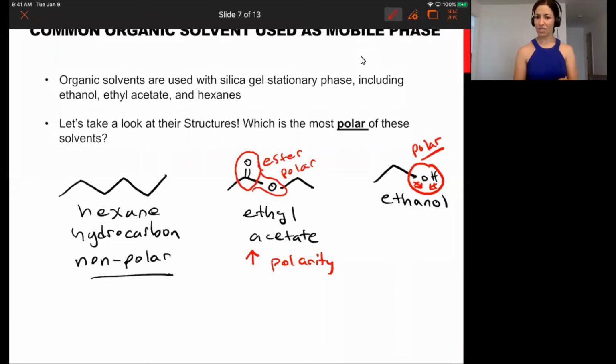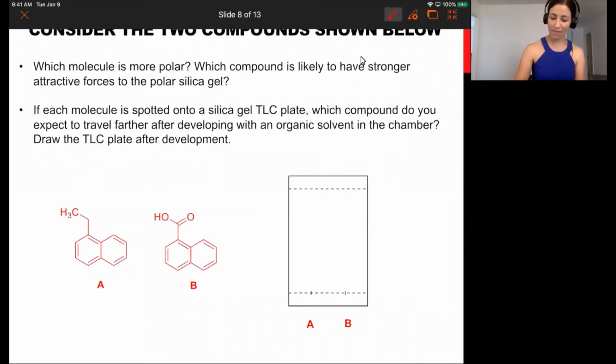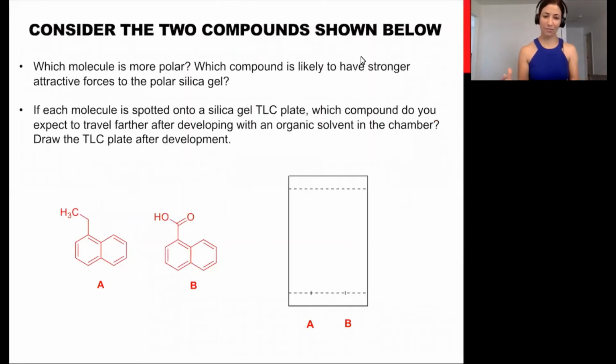And understanding the identity and relative polarity of these solvents is important for that discussion. For this lab, this term, understanding the relative polarity of these 3 solvents among the many you could use for TLC is what I'm going to ask of you. Okay, so let's look at some specifics and consider some different examples using actual organic molecules.